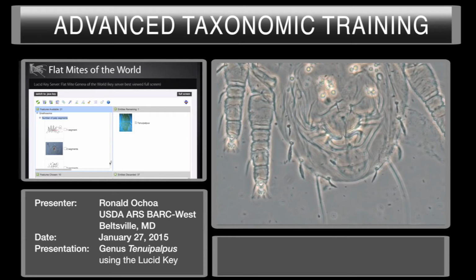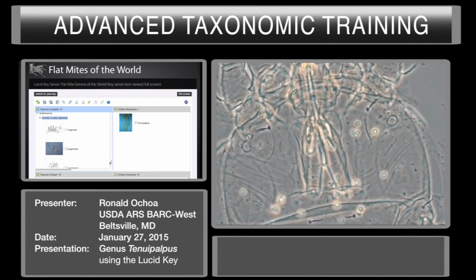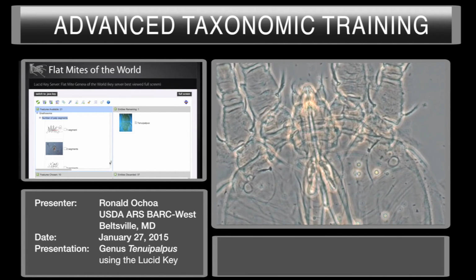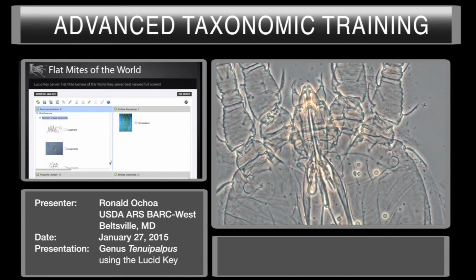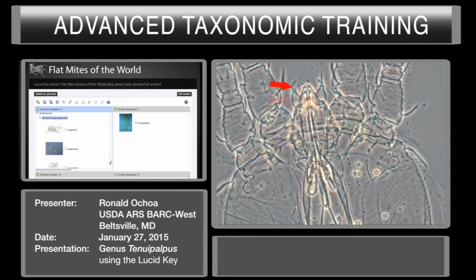Let's see with the mite. Go over the mite. And you can see that this one has 1, 2, and 3. Just 3 segments.